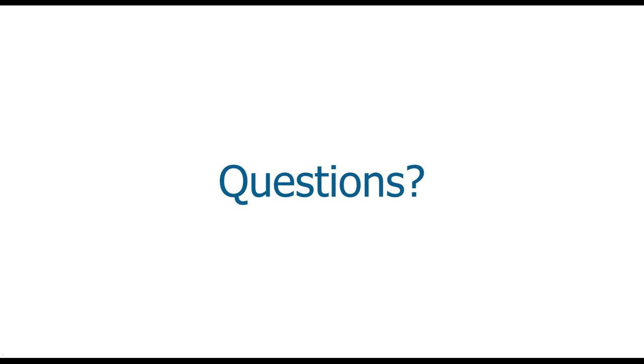Okay, so I can probably take a first stab at this question, and then maybe Bitu can weigh in on their approach as well. So this is first a statistical question, I would say. It depends on what the variability in your sample is, so understanding if 2 populations are different. But if you just need a rule of thumb, then think about differences of 1 to 2 degrees Celsius. That's where they start to become, I would say, put into different buckets between your best performers and maybe your next tier and your next tier.